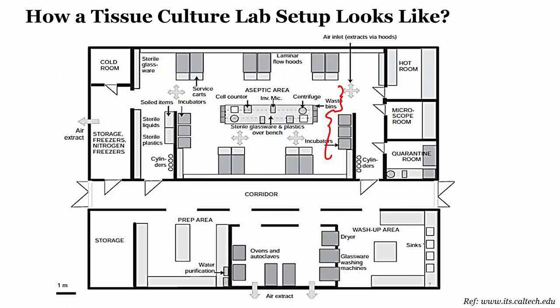So, most of the facilities, right, are kind of in a clean room environment, not really required, that depends on what kind of applications you are working on, but otherwise it is always good to maintain a clean room for this kind of study, since you are taking care of removing the bacterial contamination as far as possible. The quality of air is better compared to a normal laboratory environment, right? Now there is a hot room.